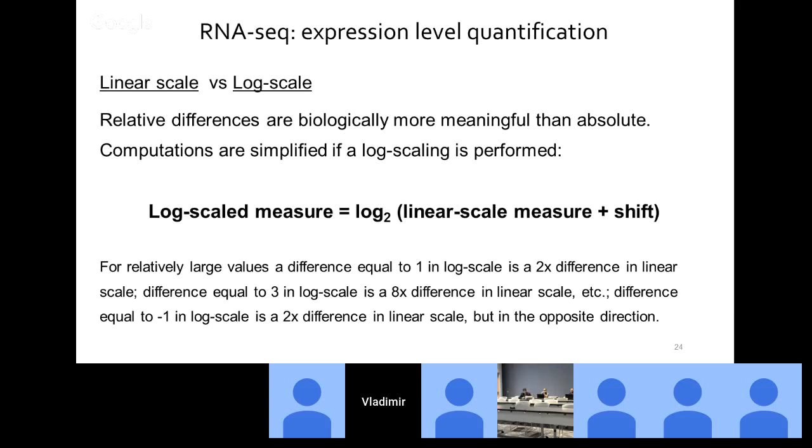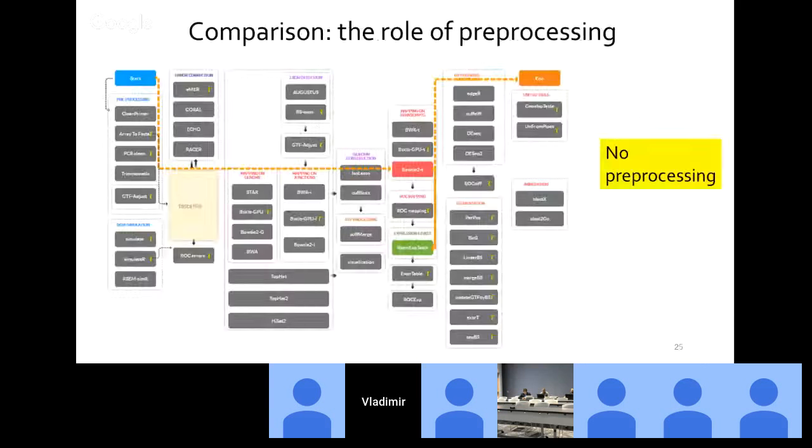Please keep in mind that genes with low level expression are hard for analysis, as their expression level is measured imprecisely by almost any type of analysis, including RNA sequencing. So if the expression level of a gene is really low, for example 0, we should keep in mind that it's just an approximation of an expression level with potentially high error, just technical error.